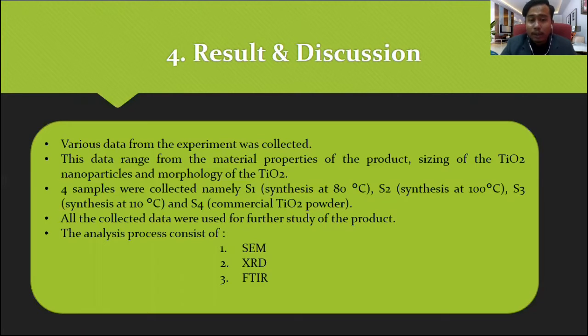Sample 1 to sample 3 are the experimental samples, and sample 4 is the commercialized titanium dioxide powder. All the collected data were used for further study of the product, and the analysis process for the samples consists of SEM, XRD, and also FTIR.